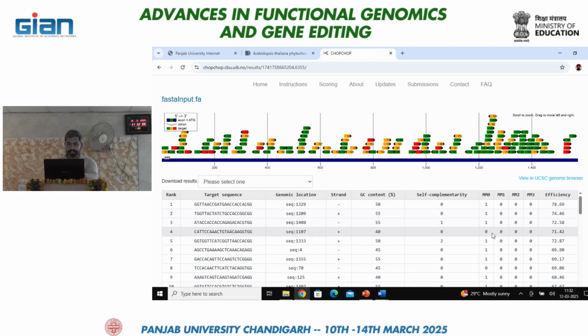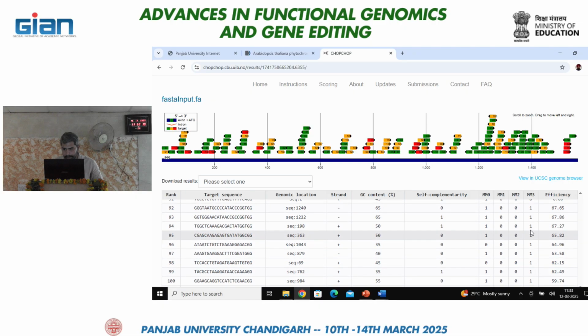But according to me, these should all be 0, then it's good. Like with the MM3, as I have shown you in the example, starting from there, with three mismatches our sequence binds with one off-target. That's what it is showing. But with a different tool, I think you will understand this better.